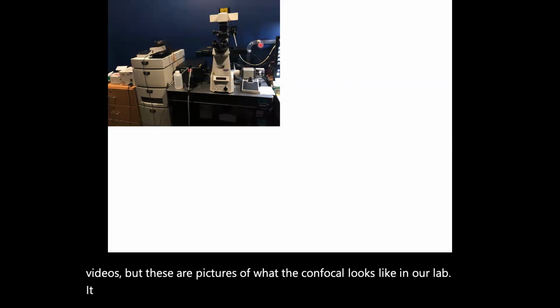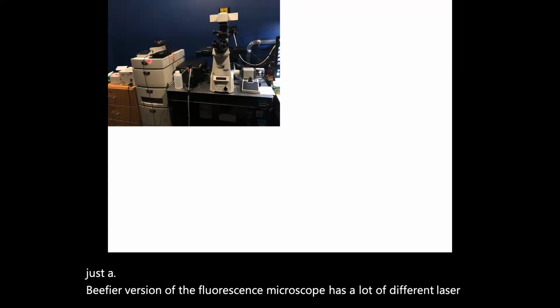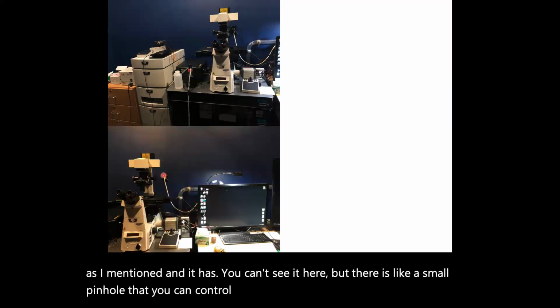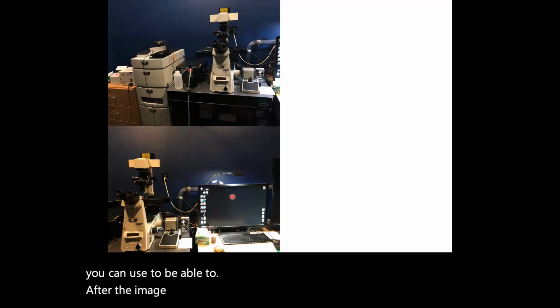It looks, honestly, if you've ever seen a fluorescent microscope, it's just a beefier version of the fluorescence microscope. It has a lot of different laser settings that a fluorescent microscope doesn't have, and it has that motor as well, as I mentioned. And you can't see it here, but there is a small pinhole that you can control. And it's connected to a computer that you can use to capture the images and display the tissue or the cell live on the screen.